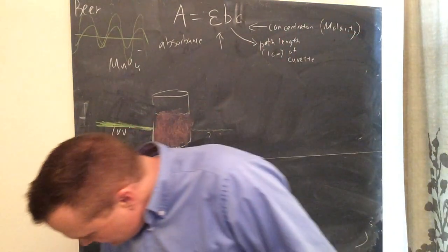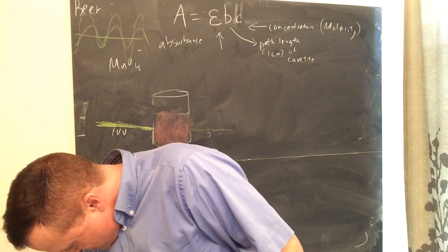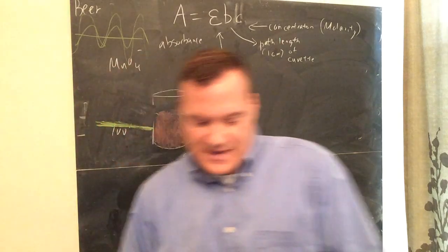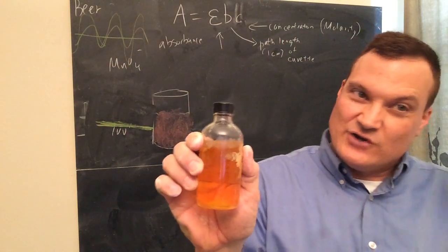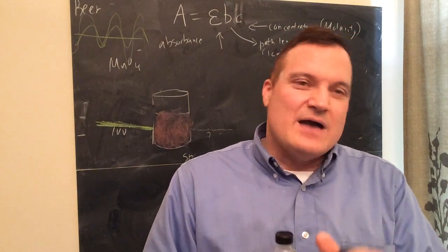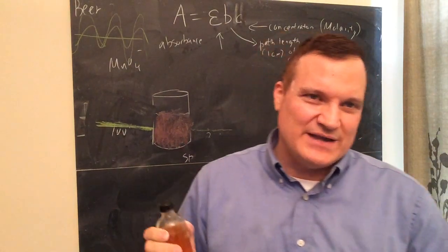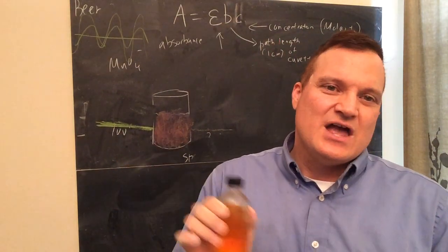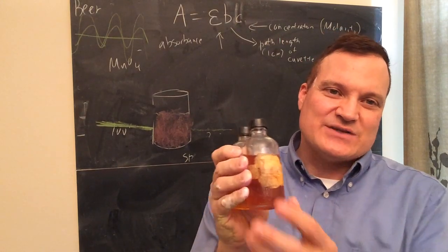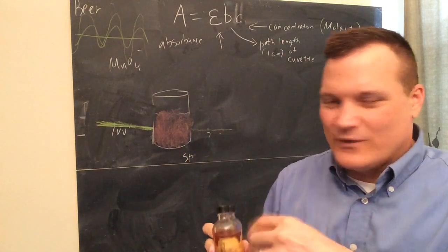And it tells you in the experiment that we're going to have iron plus 3 chloride. It will look like this, really dark. But then we're going to add some other chemicals. One's an organic chemical because it turns out better if we slightly change the color for whatever reason. I don't know why. We could have just used orange. But they decided to add some chemical, and so it ends up looking more reddish. So instead of being orange, it's kind of between these two. It's kind of a reddish color, the one you do.